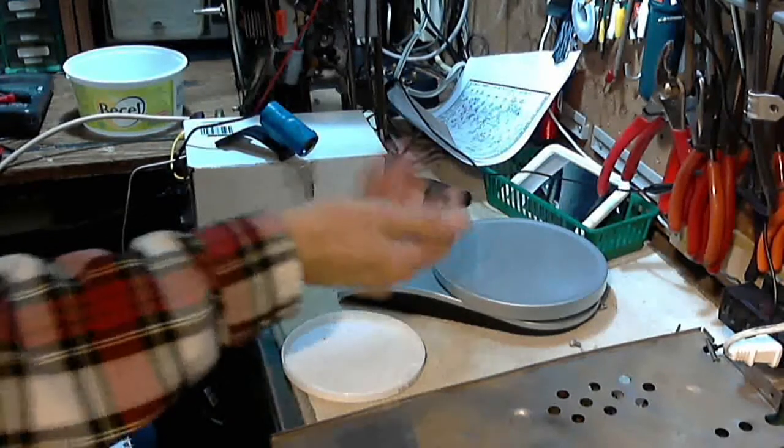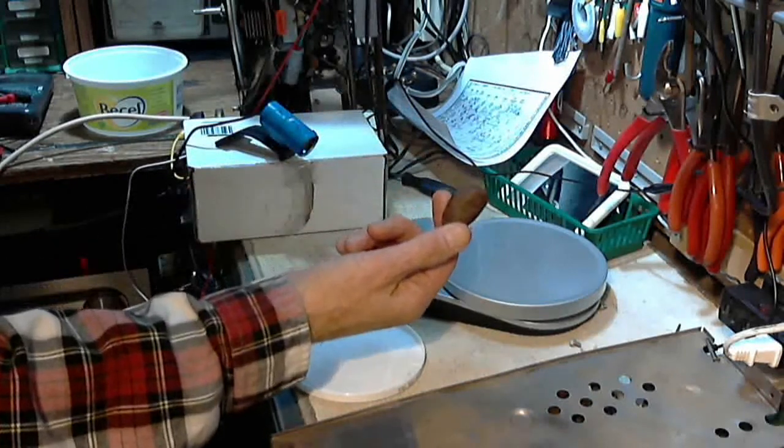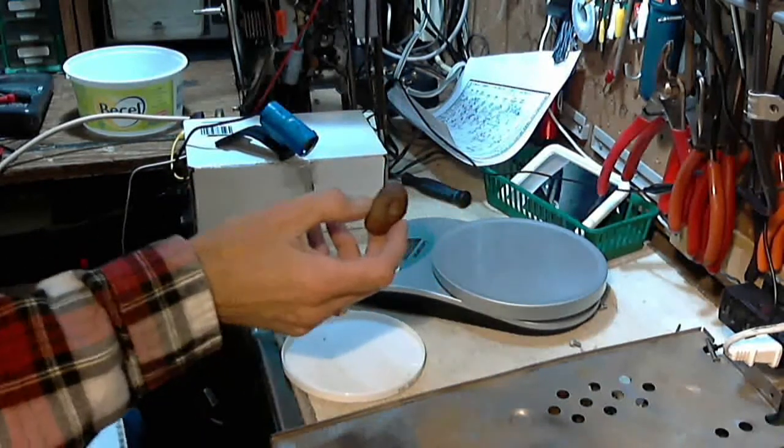I think this thing is pretty darn dense, so it may go some way to eliminating what it may not be. So let's do a few measurements here.